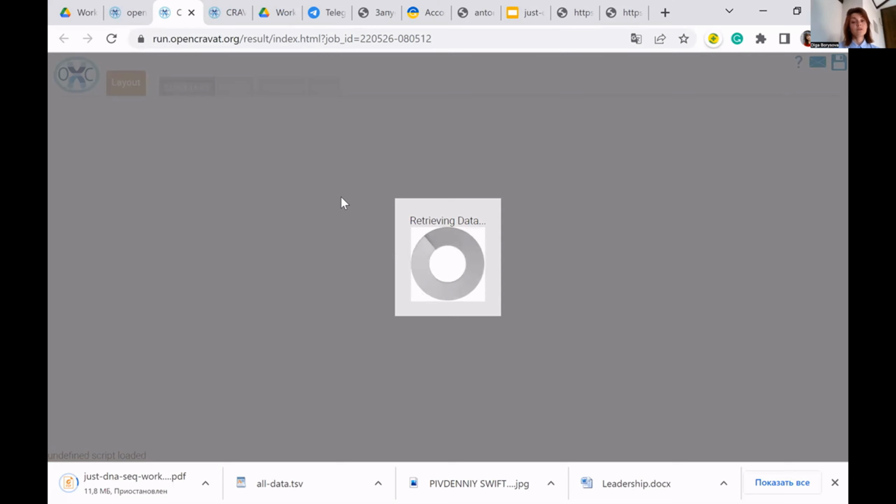And if it works too slowly, we will have to switch to our server.